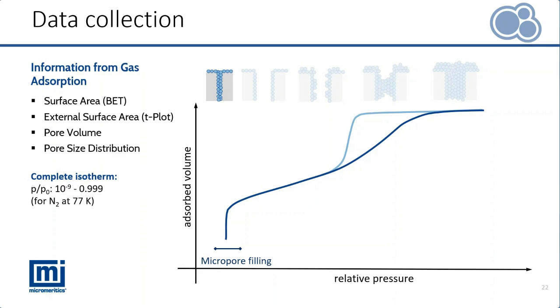The adsorption process begins at very low pressure in the micropores. The limiting uptake here is related to the accessible micropore volume rather than to the internal surface. The magnitude of surface area is directly related to the pore size and the available pore volume.